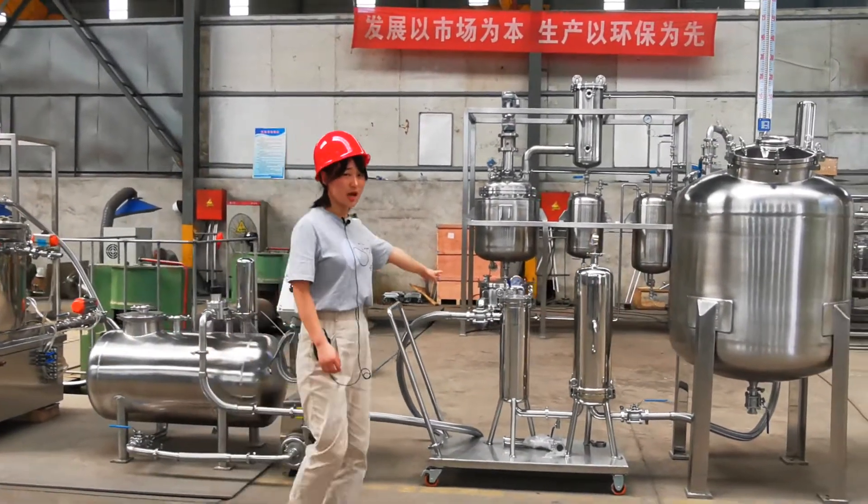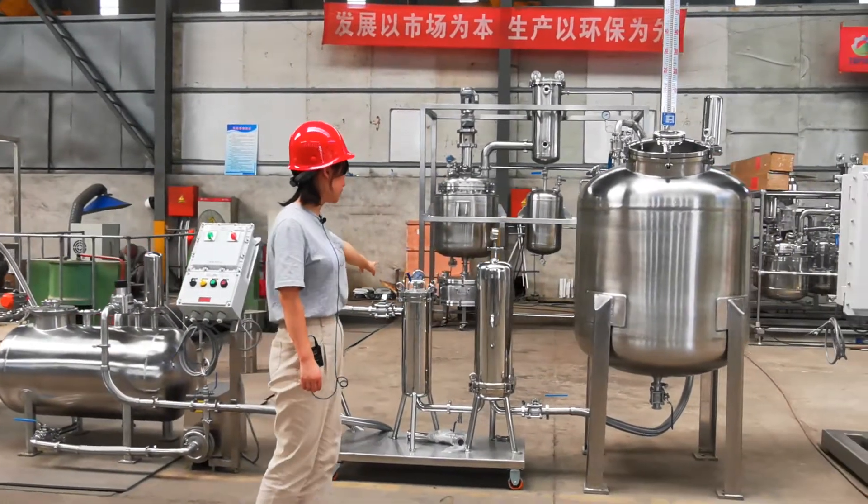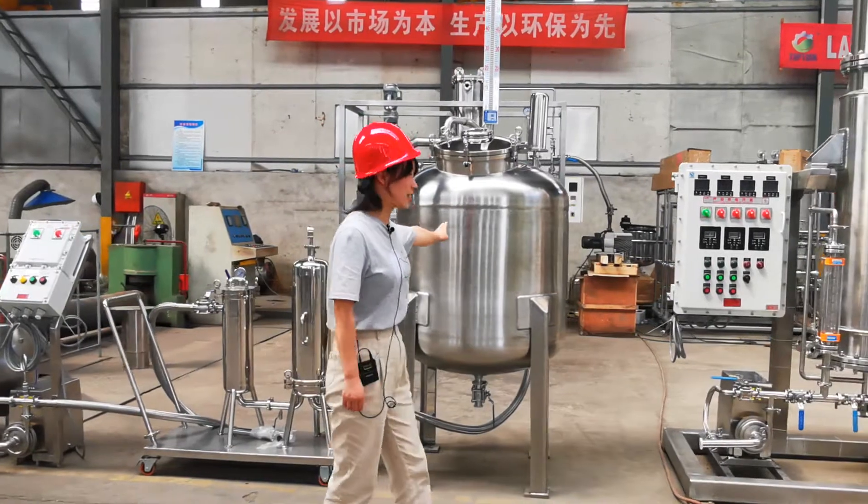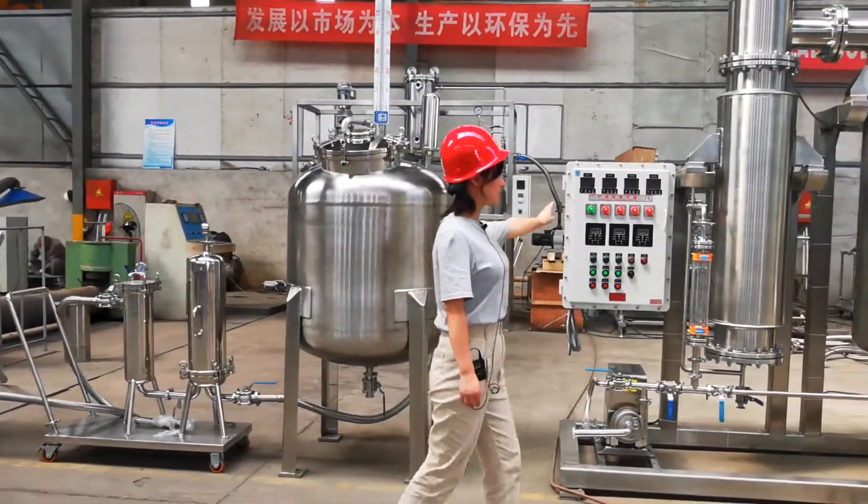For this part, this is our filtration system. And it's also the storage tank for this step.